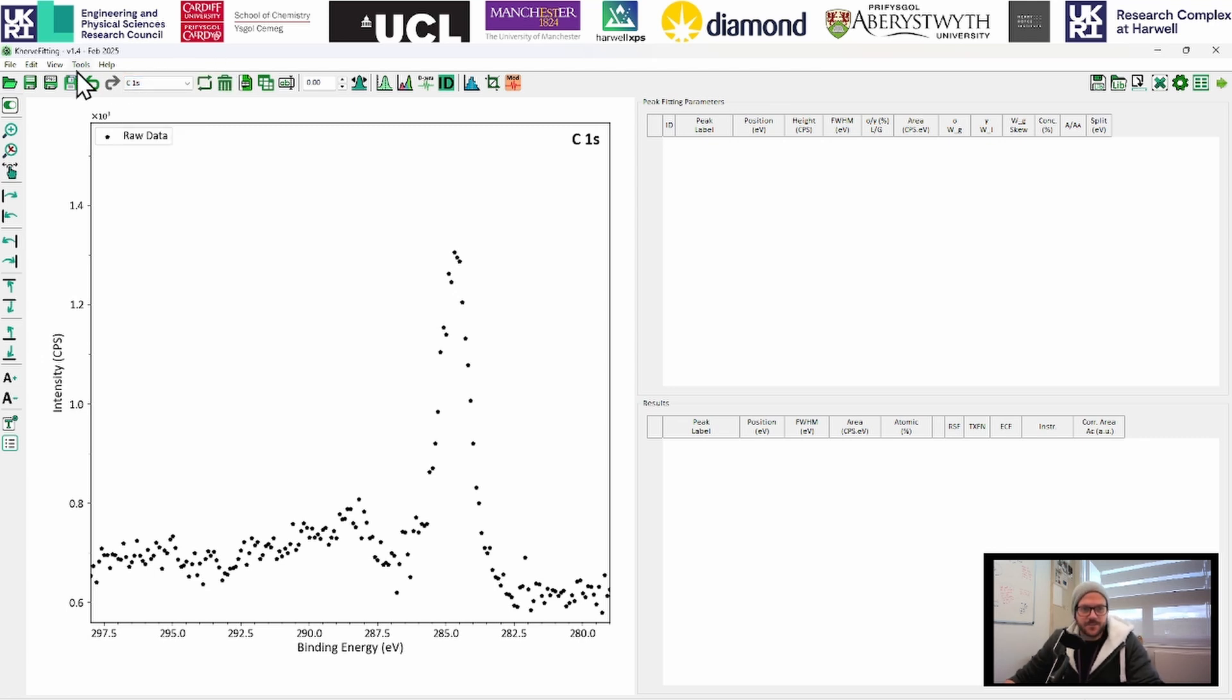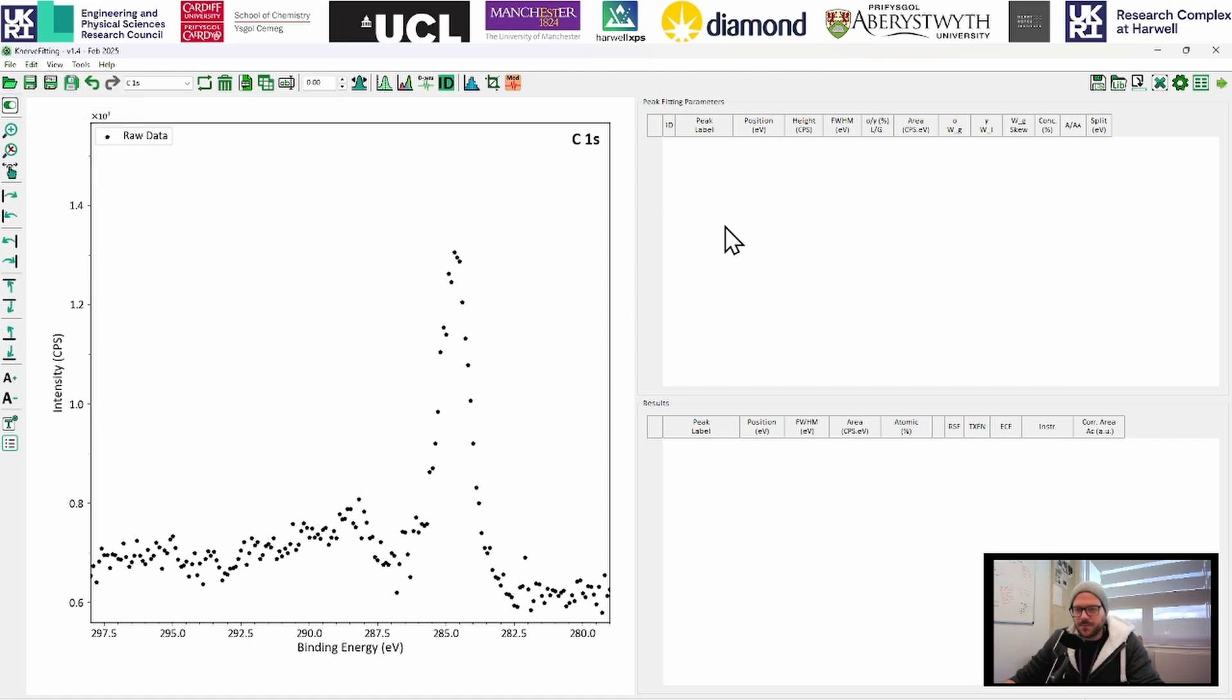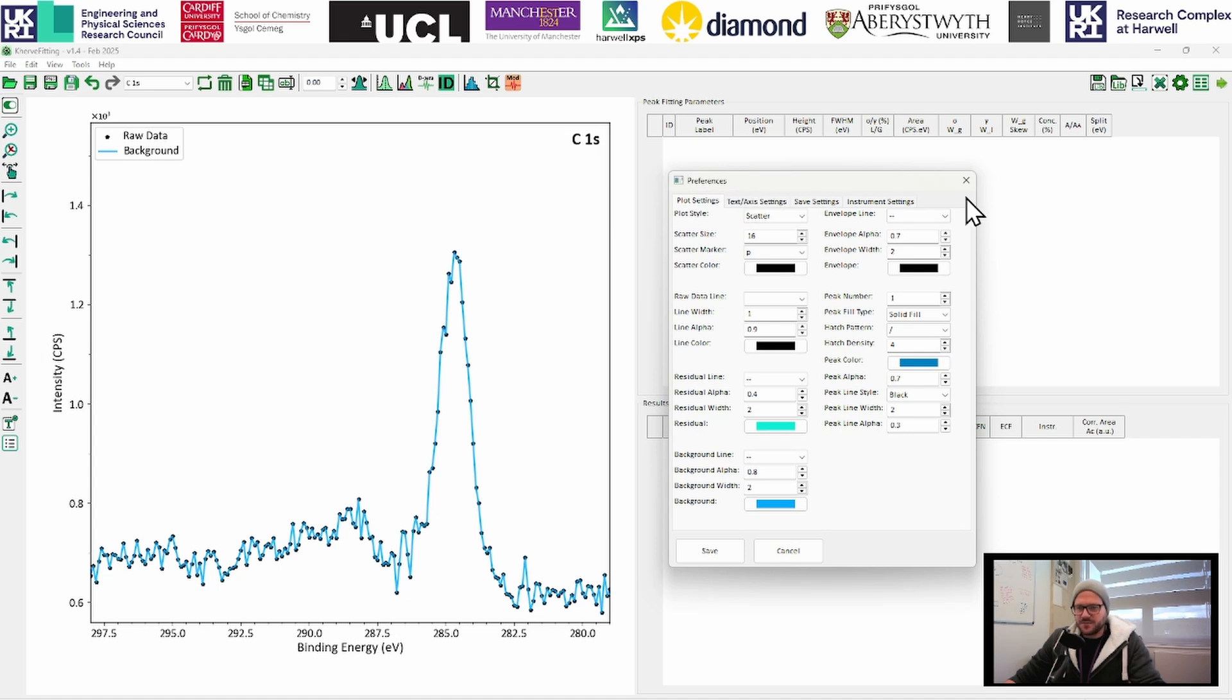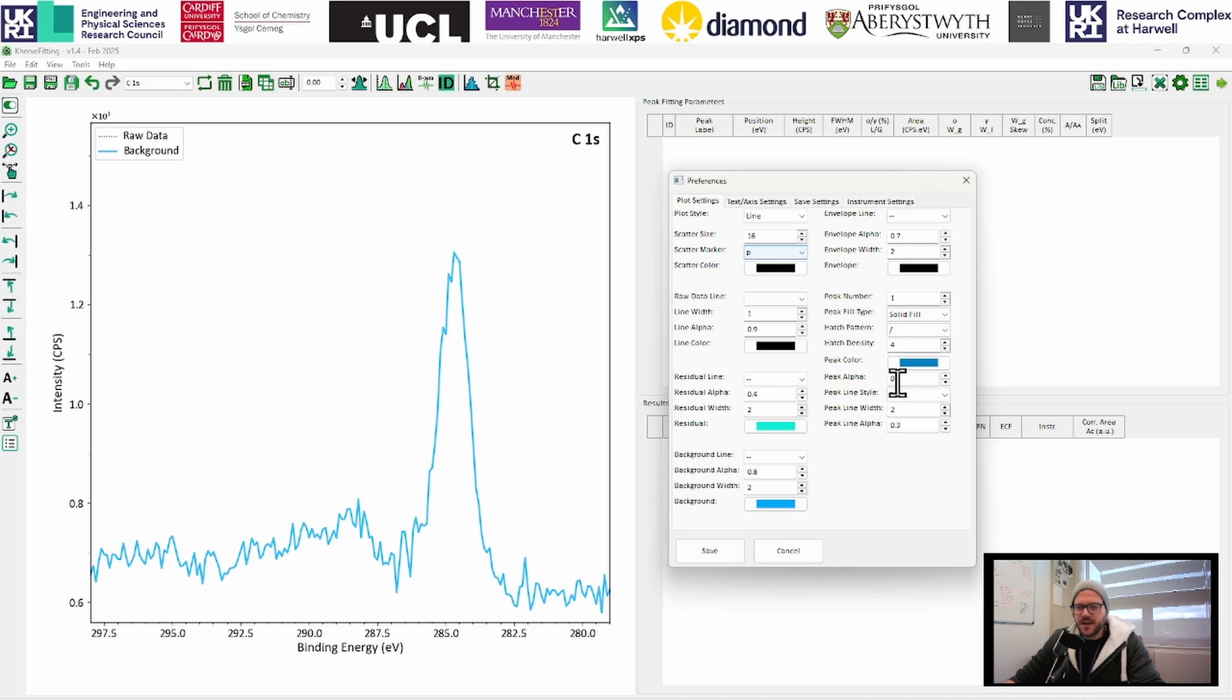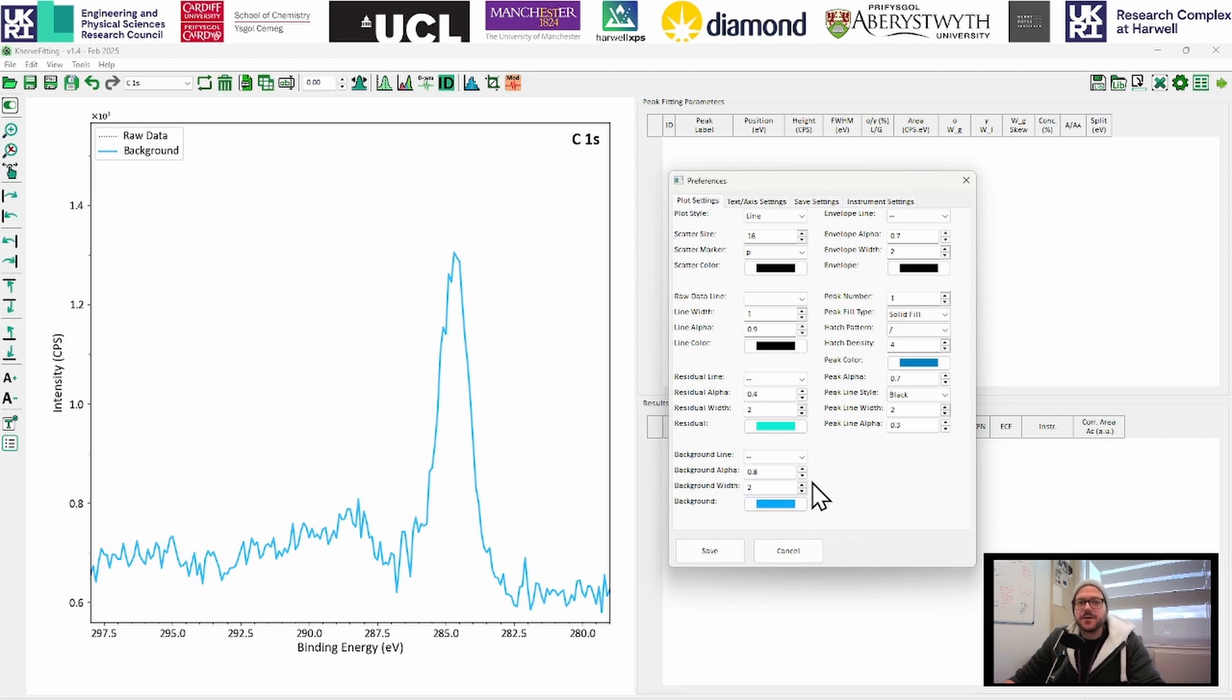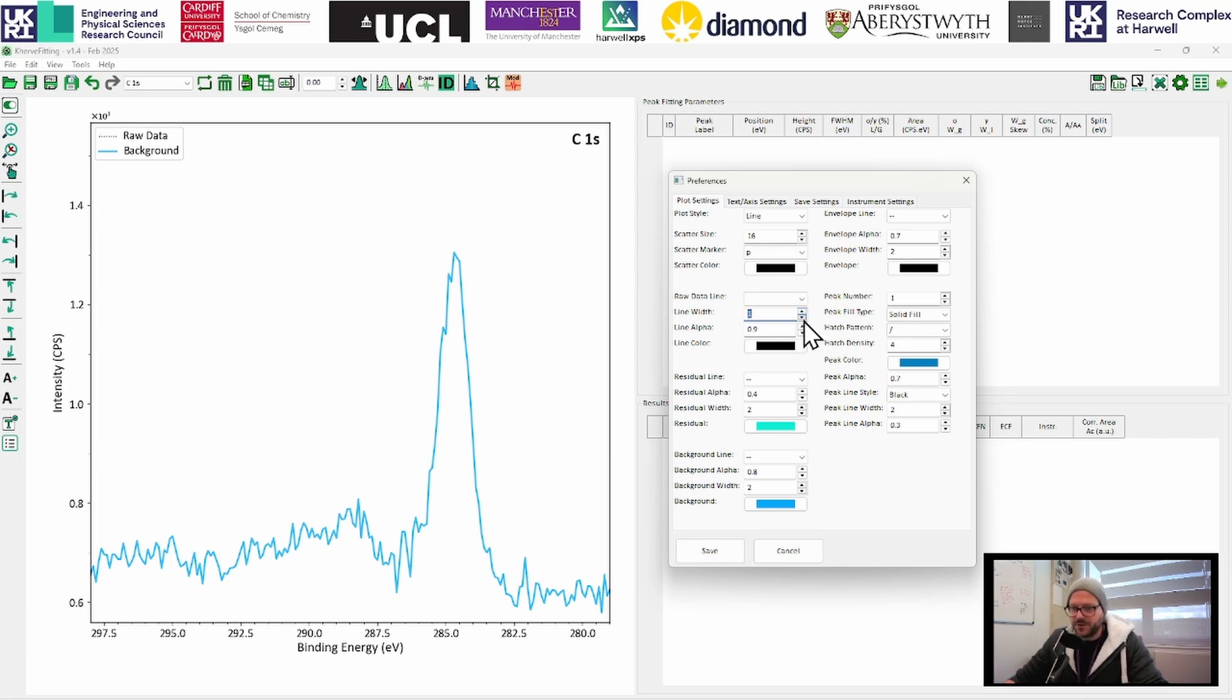One of the first things I'm going to do is just head into preferences. I just want to make this look a bit different, like how I prefer. So the first thing I'm going to do is change this to a line plot. Immediately, we can't see that line anymore because the software puts in a background for you. And because we have no regions at the moment, the background just overlaps our data.